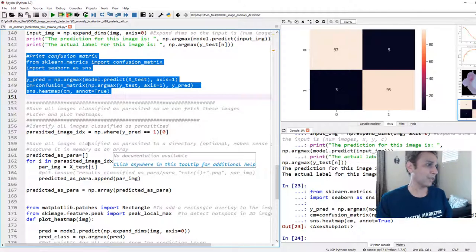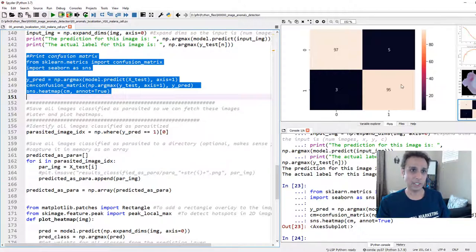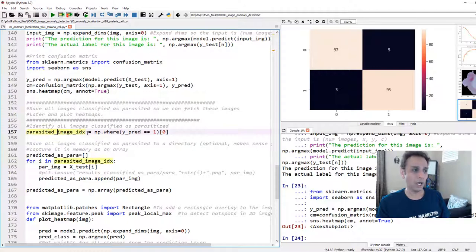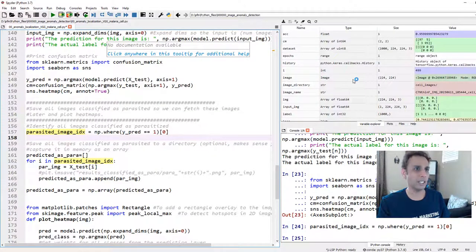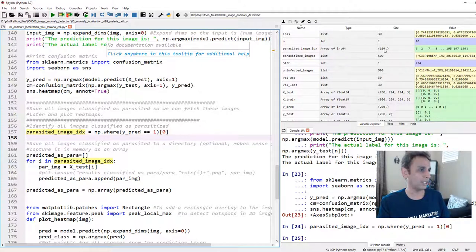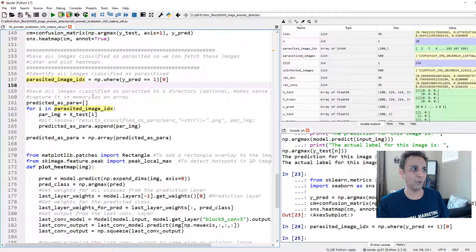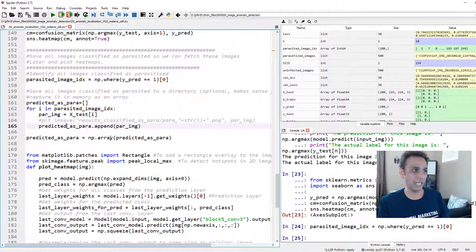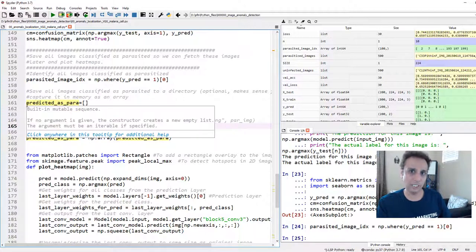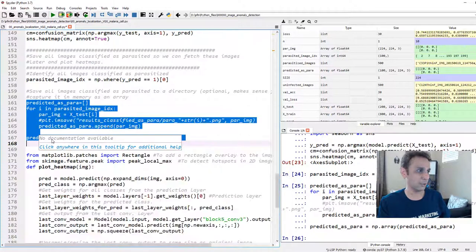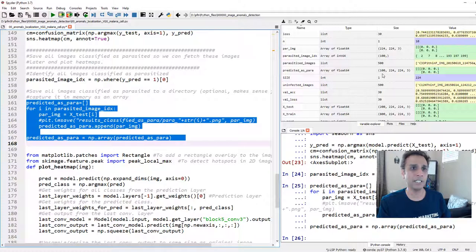Now let's localize these parasites. First, let's identify all images classified as parasitized — I get the indices wherever y_pred equals 1. There are 100 such images. Since it's only 100 images, I'll save them into a new NumPy array rather than to disk. So now we have 100 images predicted as parasitized, shaped 224×224×3.